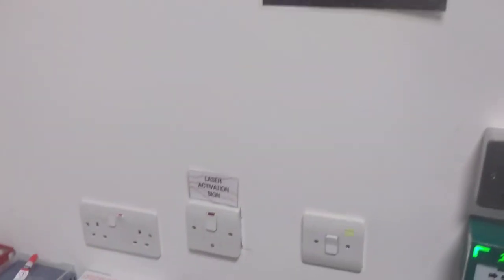Before you turn on any components, you must first turn on the laser activation sign, which can be found on the wall. You then need to go outside and check that the sign is active.